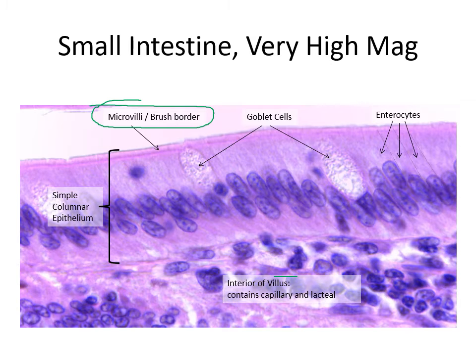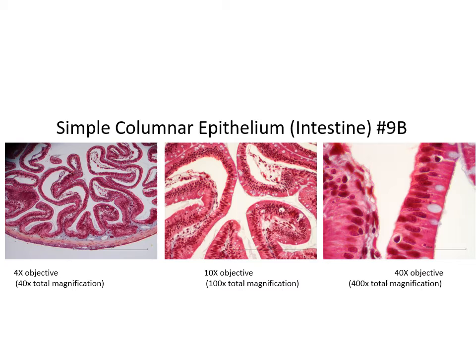Again, on the inside of the villus that's where we're going to find the capillary and the lacteal — which is where those nutrients, when they move into the cell, are going to move across and then into either the capillary or the lacteal. Here's another image from our lab of simple columnar epithelium from the small intestine. On this high power view you can see the microvilli on the tops of each cell, and here's another example of a goblet cell.